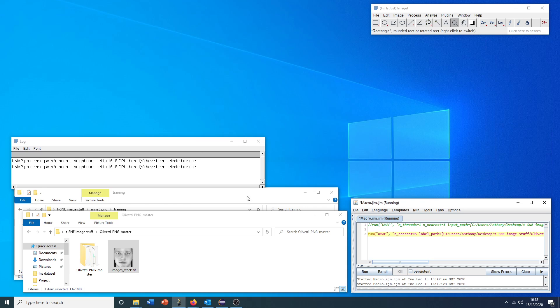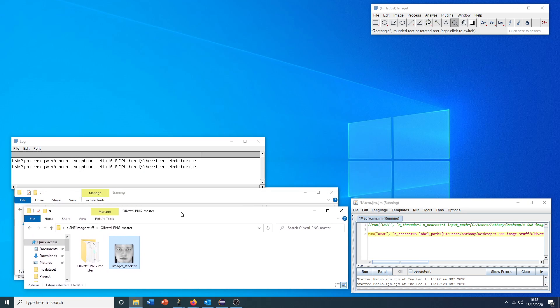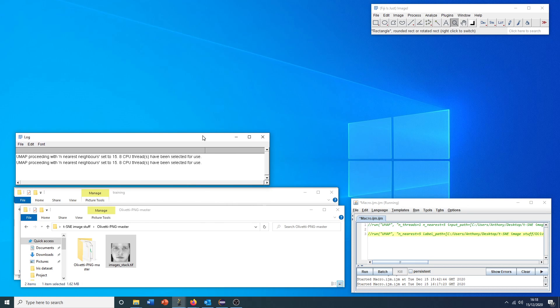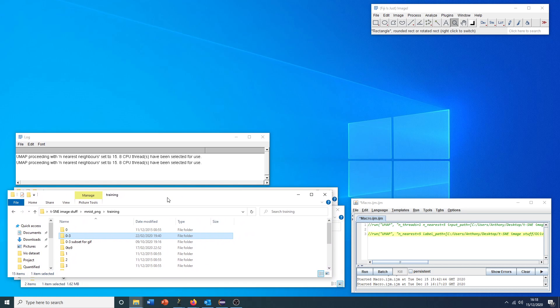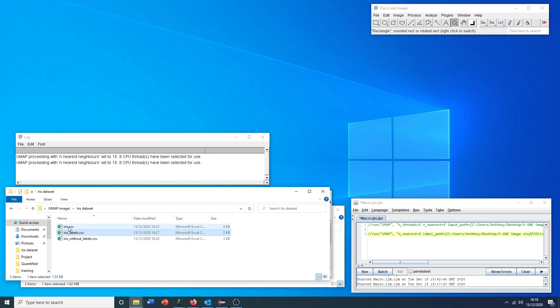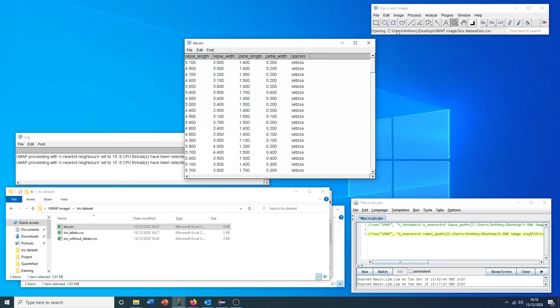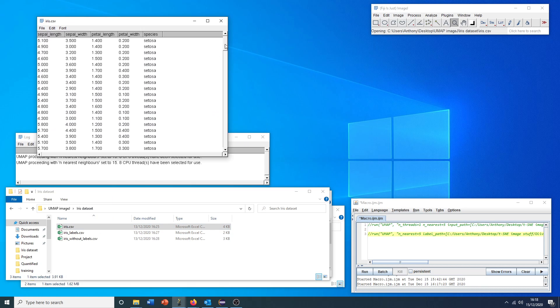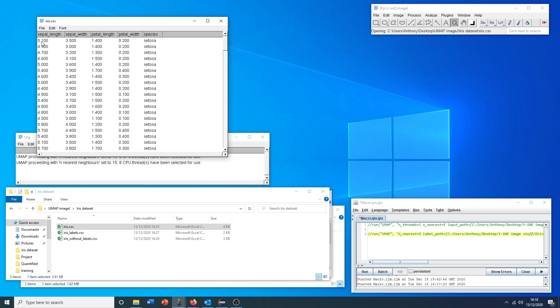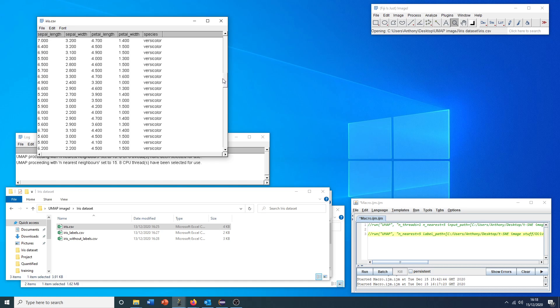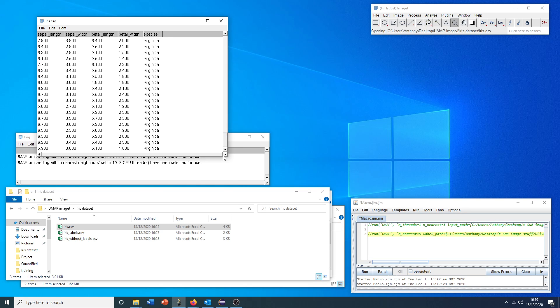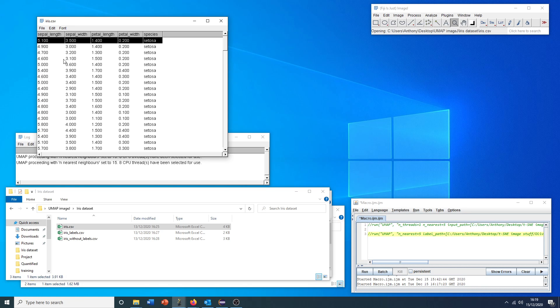Now finally, even though this video is probably going on a bit longer than I wanted it to originally, I can show you how to run this dimensionality reduction plugin on non-image data. Image data is actually just data. It's just presented in a certain way to the user, like a structured array of data. For this, we can run the tool on, for instance, this traditional machine learning dataset, which is the Iris dataset. This is I think 150 flowers, flower instances, and four accompanying metrics for each flower.